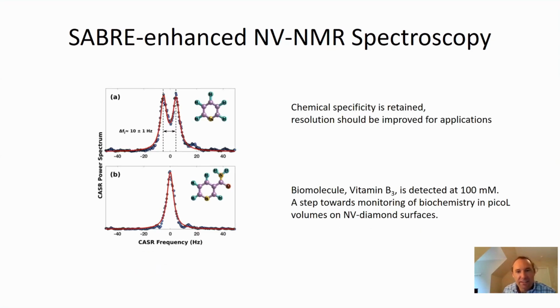Sorry, Thomas, there is a question from John about the previous slide. That NV detection picture assumes the sensing volume associated with single NV stochastic polarization detection. How big was the actual sample in the experiments? Okay, the actual sample was large. It was 0.5 milliliter. So the assumption has to be made that we're only detecting spins from very close to the NV center.